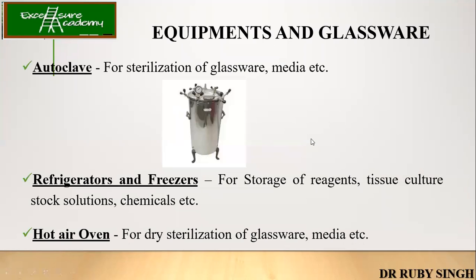Then autoclaves. Autoclave is required for sterilization of the glasswares and the media. If you remember, the temperature is around 121 degrees Celsius. For 15 minutes, we keep the sample at this particular temperature, and after that, it is cooled off.